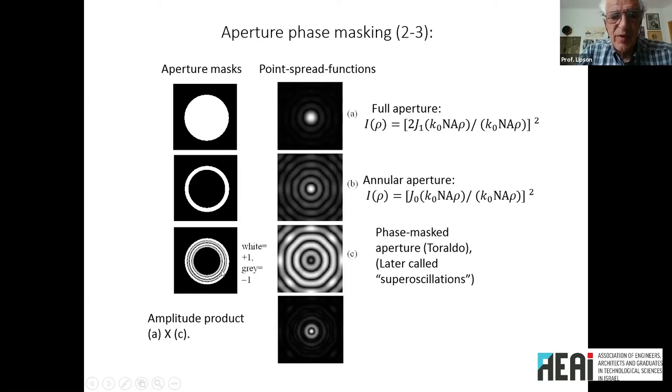And this is an example of a system with four rings. You can see there's a very small center spot here, but unfortunately a lot of light gets into the field outside. And so if your image is bigger than this region of black around here, then you really can't use it very well.